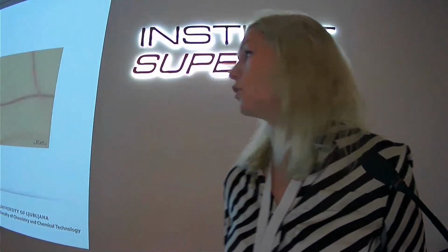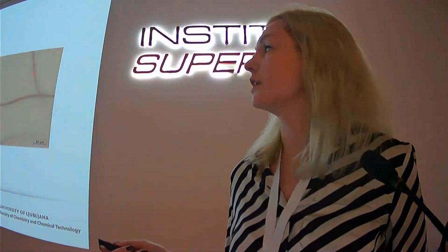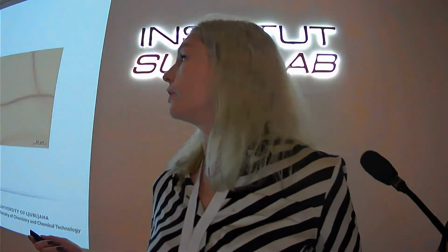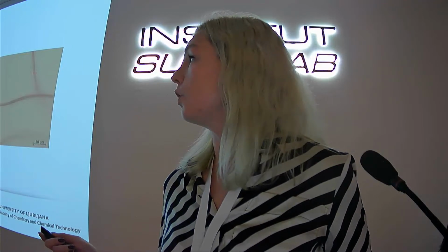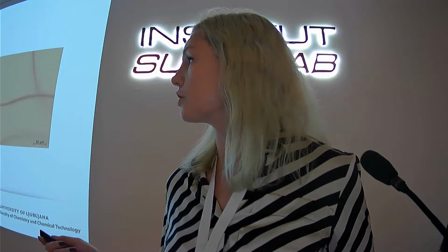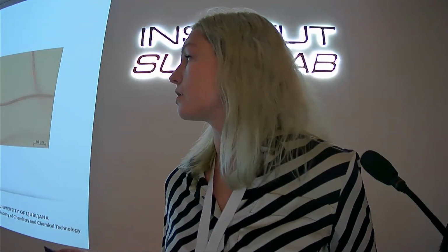But with fibers, of course, you cannot use, for example, DLS or a laser diffraction analyzer. So usually with fibers, the best way is just to measure them with some microscope. For example, here we have very, very long fibers. So we were measuring them under the optical microscope with the software. Here, because it was so long, we needed to divide it into two pictures: the first part of the fiber and then the second part, and just sum it up to get the total length of the fiber.